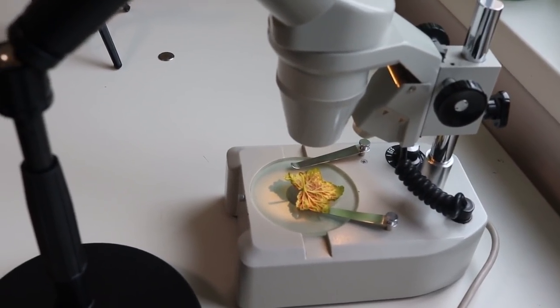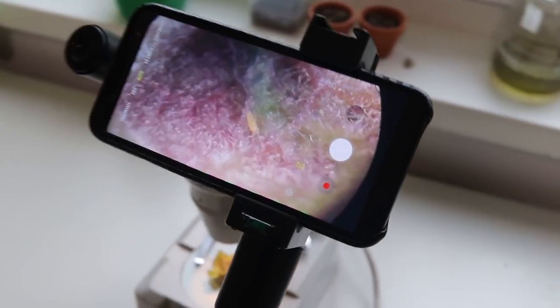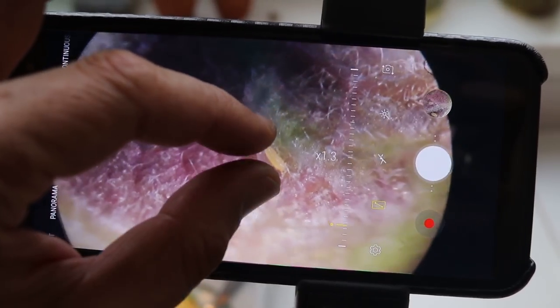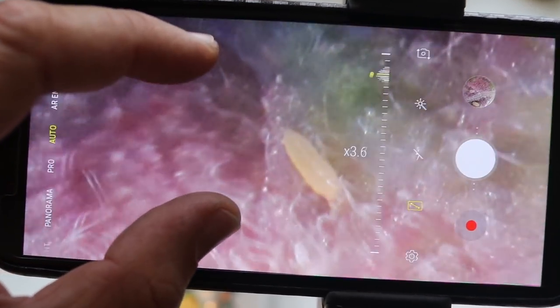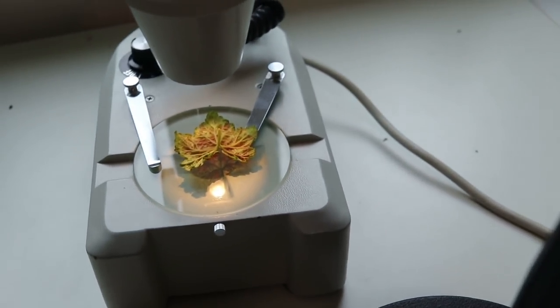This is simply my microscope setup so you can also see how I'm actually making these videos. I connected my mobile phone camera using a stand directly in front of the eyepiece. It's a microphone stand that I bought and it works quite well. Then I said okay, I want to see them move.